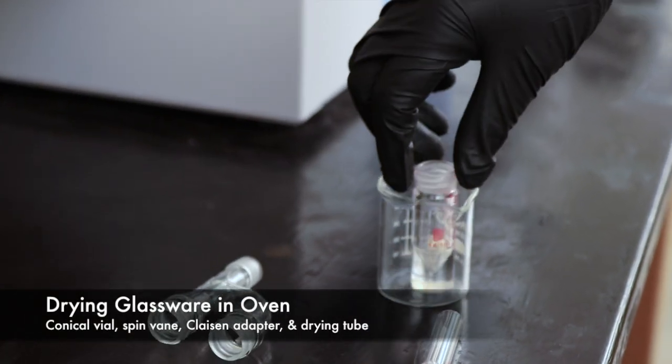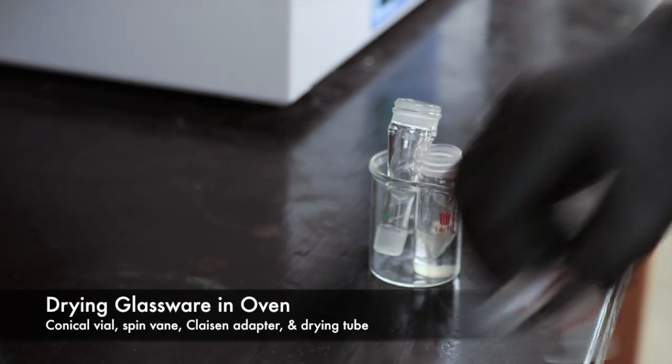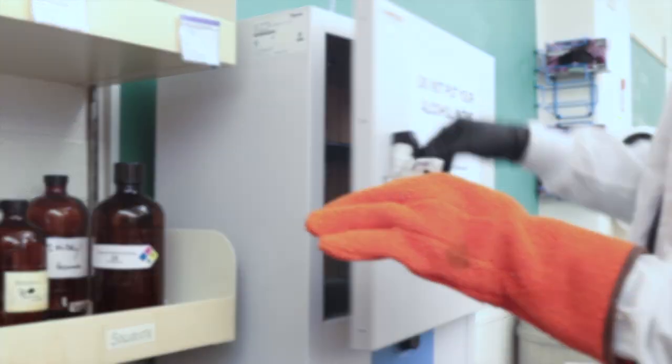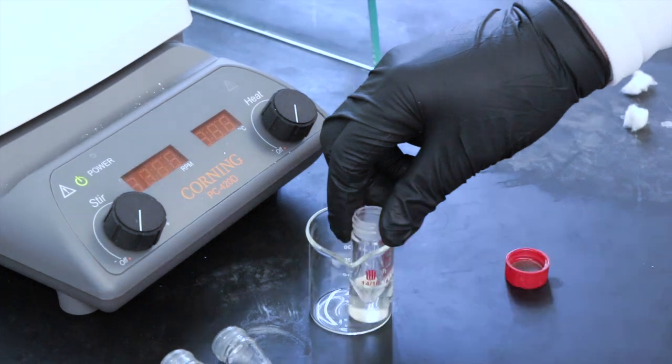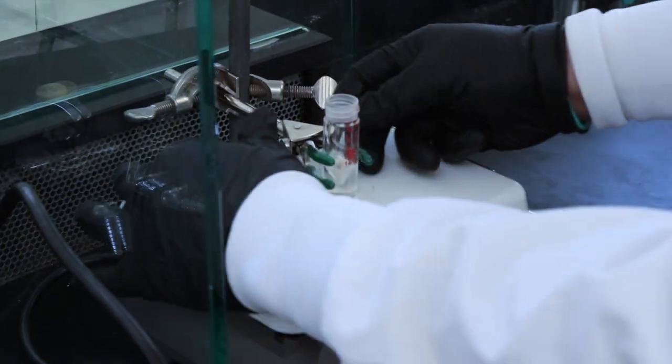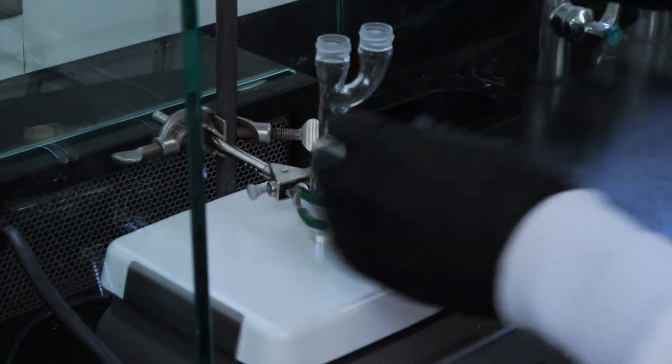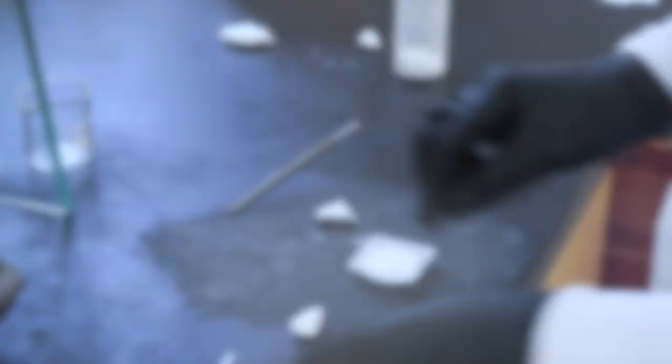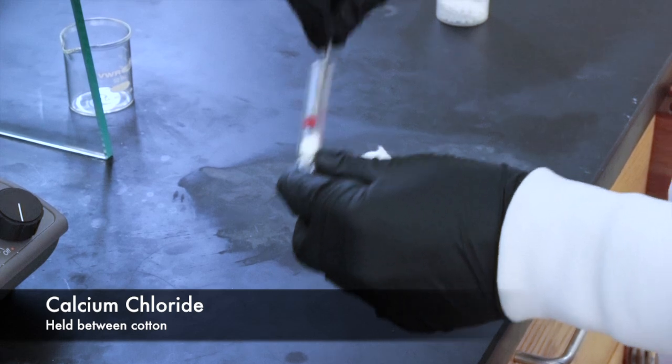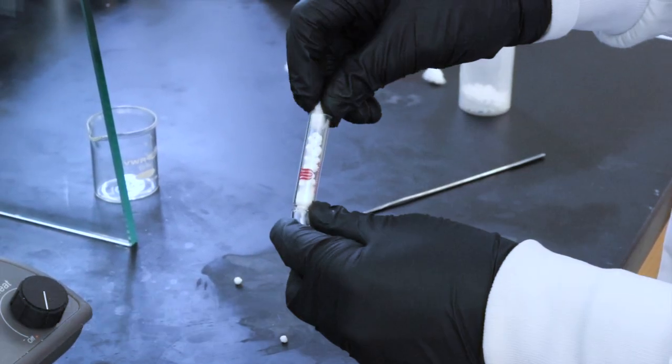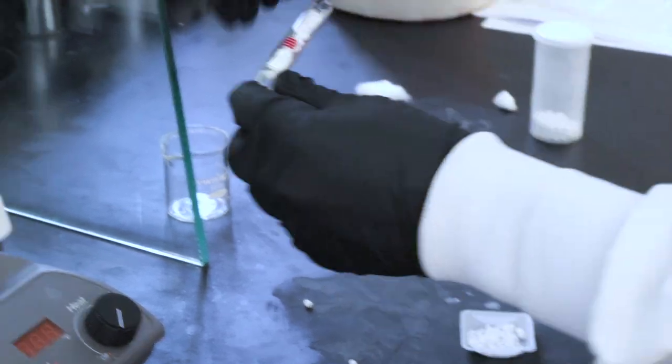I'm going to put all of the glassware in the oven. This includes the conical vial with a spin vane, the Claisen adapter, and the drying tube. And we'll leave them in there for about 10 minutes just to make sure everything is dry. Here I'm just going to set up the apparatus real quick making sure after adding the Claisen adapter to have the cap and septum so I can add the reagents. I'll add calcium chloride to the drying tube to absorb water from the atmosphere just to make sure that water doesn't react with our borane complex.